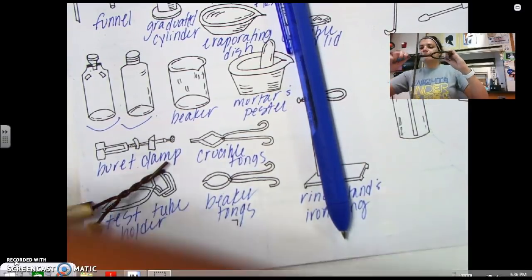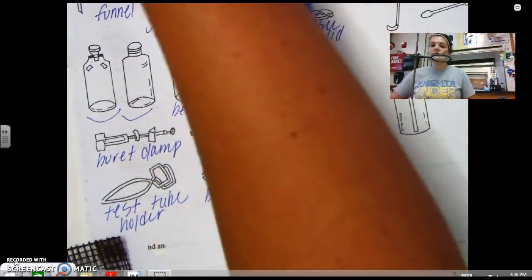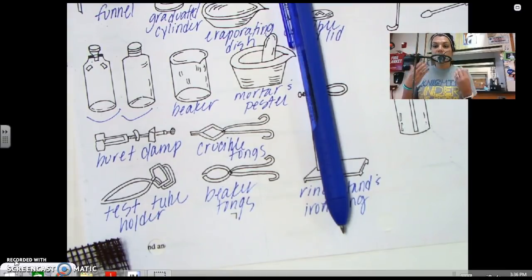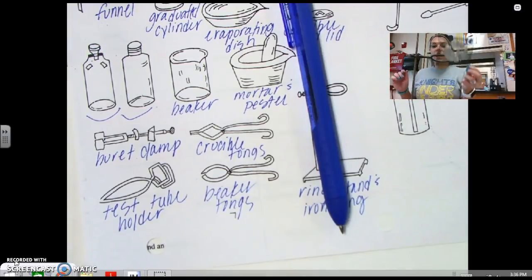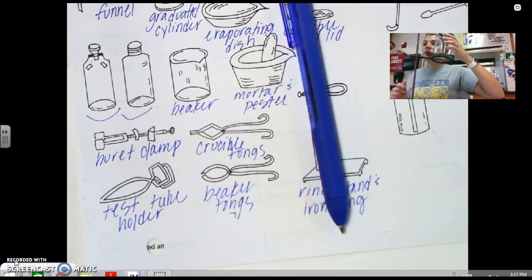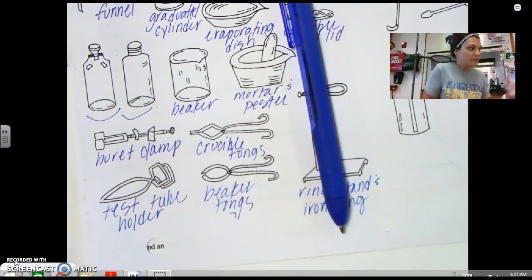So what we use is these things called clay triangle, which we'll write a definition down for a second. The iron ring goes onto the ring stand like so. And then we can take our clay triangle, put it here. Next thing, wire gauze, which I'll also talk about. Or I'm sorry, clay triangles are for our crucibles. This clay triangle is a little bit big, but most of the time the crucible can fit on the clay triangle, and that way we can heat it here. Or we can take the clay triangle off. We can use wire gauze, which we'll talk about too. I'll get a definition down. Put it on top of our clay and put the beaker right there. This one's a little bit flimsy, but that's okay. You guys get the point. I would never want you to put a flimsy or use a flimsy wire gauze. I just happened to grab a bad one.